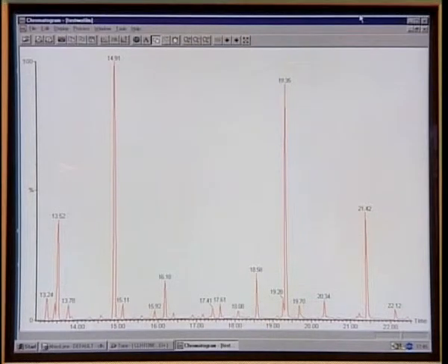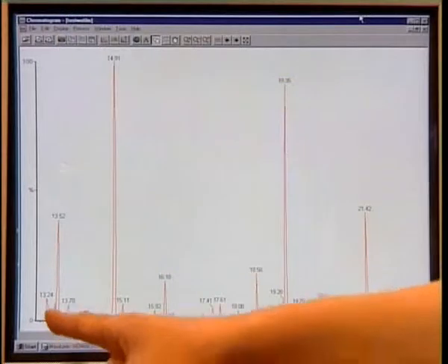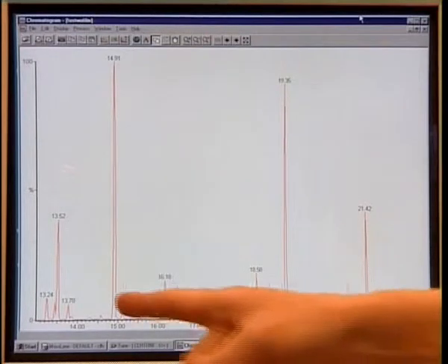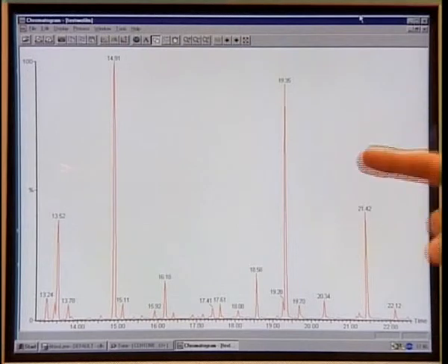This is the chromatogram that I obtained earlier for the sample of grey paint from the arch in Raphael's painting. The chromatogram shows the quantity of substance and the time it's taken to come off the column. The organic components I'm looking at here are the fatty acids — here are four fatty acids of interest. From the amount of time it takes to come off the column and from the detector, which in effect weighs the molecules, I can tell exactly which fatty acids these are. And from the exact fatty acids and their proportion, I can tell that this is a walnut oil that Raphael used as the binding medium.